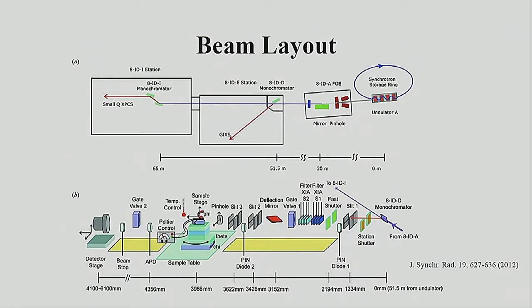So the sample is usually placed in a diffractometer stage, which allows to move the sample in different angles, and it also has a 2D detector that can be moved away from the sample, whether when we want to do GISAXS experiments or GIWAXS experiments. So the distance also defines the resolution of the Q value that we want for the sample.